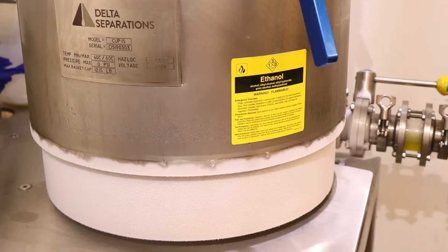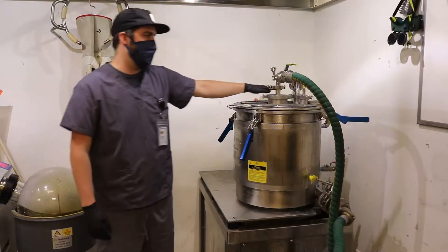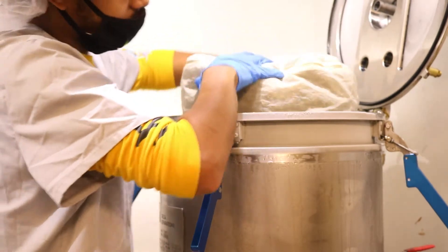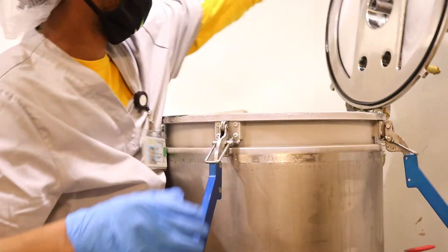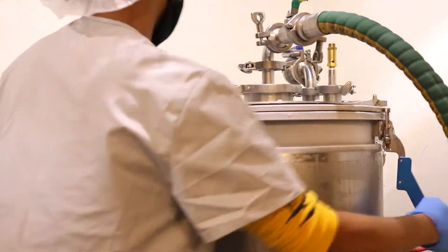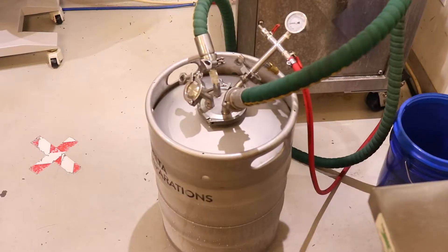This is our CUP 15 from Delta Separations. This is what we use to perform our extractions. We'll put our cannabis material — if it's flour or trim — into here. We then pump cold ethanol that we keep stored at minus 80 degrees Celsius into the basket. It then spins at a higher velocity to extract all the cannabis essential oils and return it to this keg.